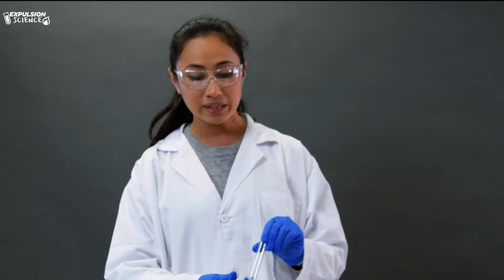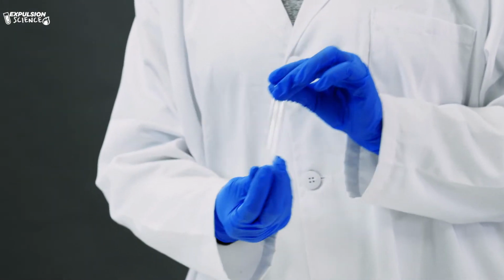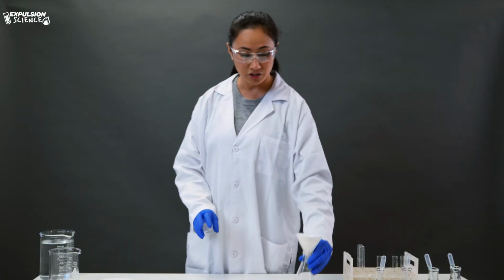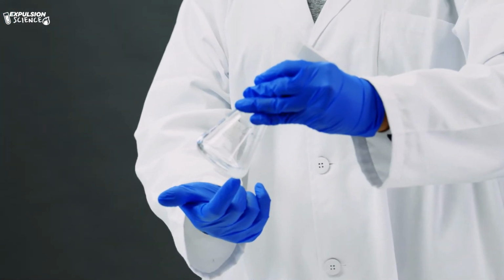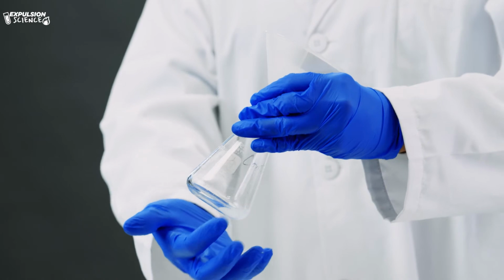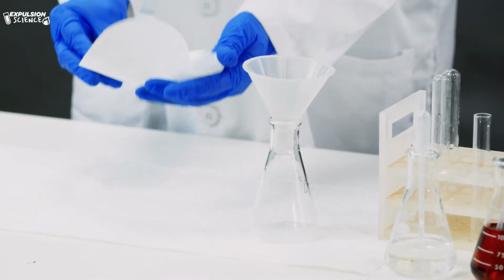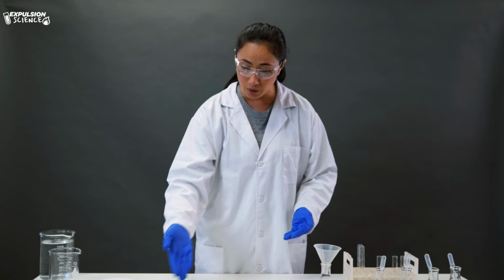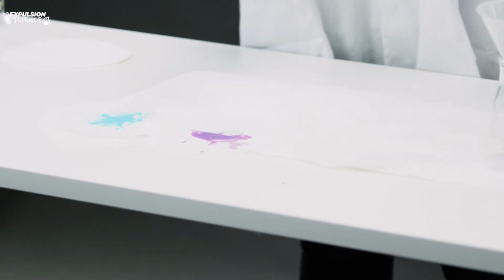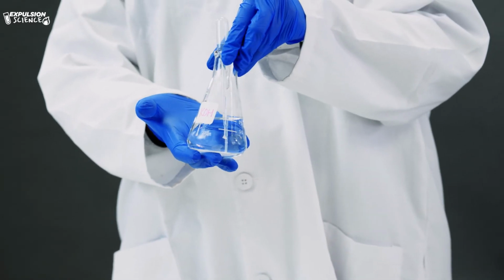We did just pour out our strontium chloride and potassium hydroxide mixture into this filter, and so we are just waiting for it to filter out. But if you notice, you'll see that we already have some of our filtrate coming out of that mixture. That's that liquid from the mixture, allowing the rest of the solid to stay in our filter paper. And so if you look closely, you'll see that there is some of that white powder. So you are seeing three different types of precipitates that are formed when you react three different substances with potassium hydroxide.